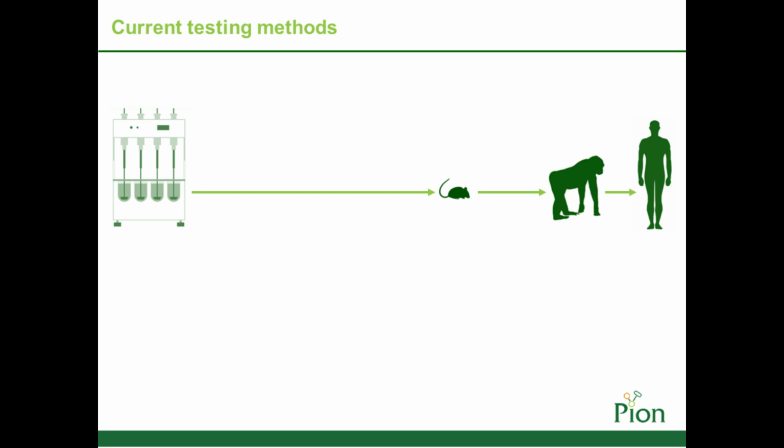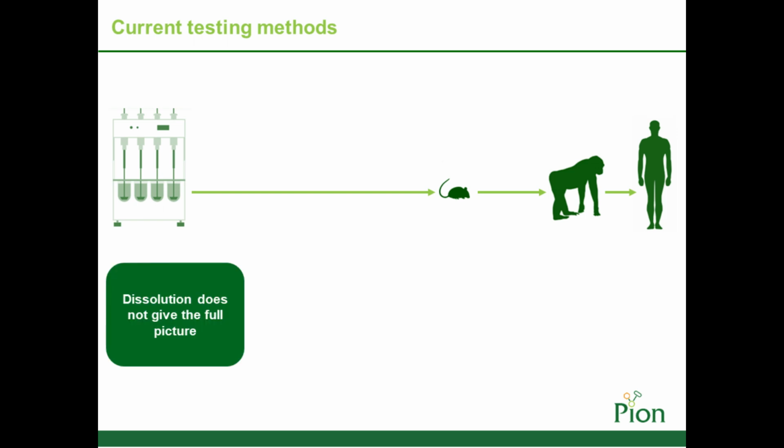So, with oral formulations, we have certain USP standard practices, for example, but for subcutaneous delivery, there's a real lack of standardized in vitro methodology and techniques employed. So scientists often still use the USP2 or USP4 in vitro methodology for subcutaneous drugs to try and find an early insight of the formulation performance, but it doesn't really give the full picture of the events occurring, and it also tends not to reflect the in vivo situation properly, as they lack the biorelevant information needed for that decision making.